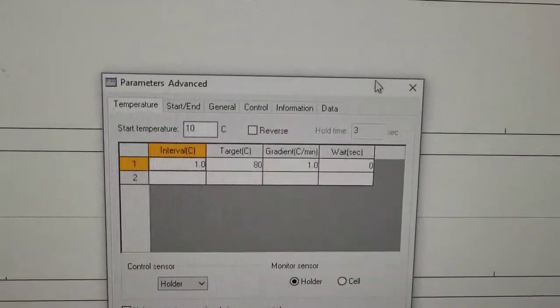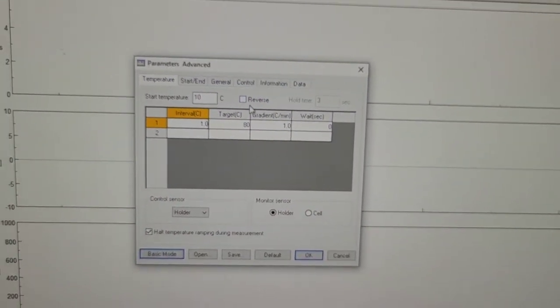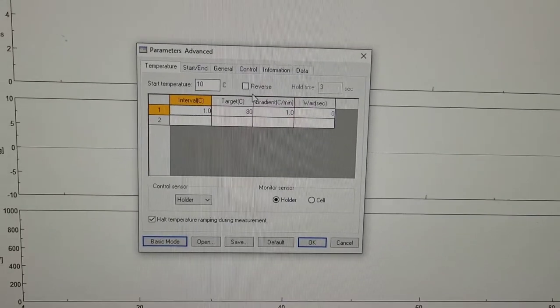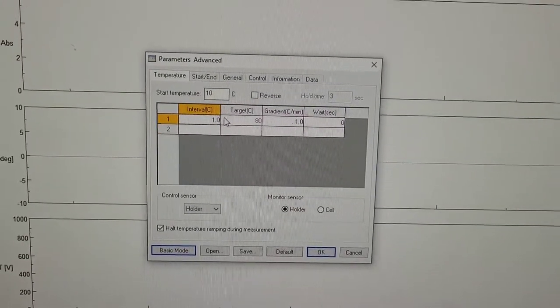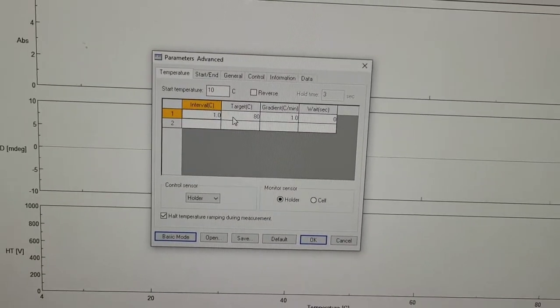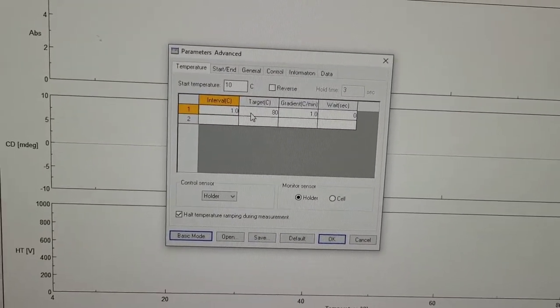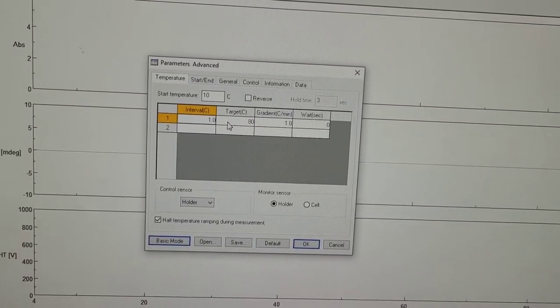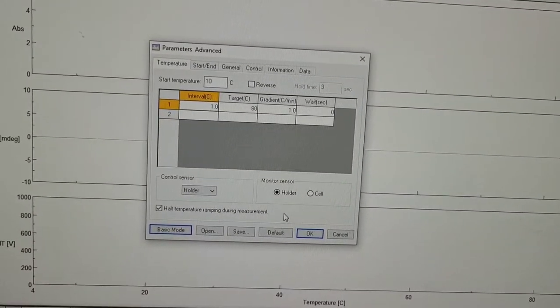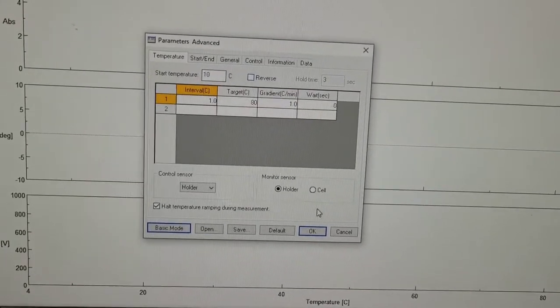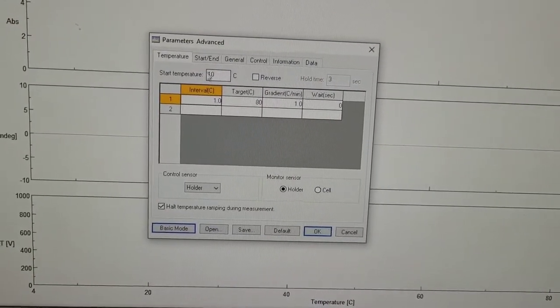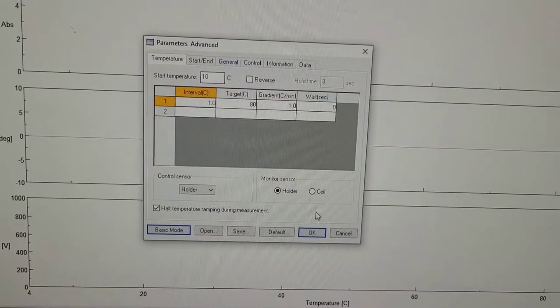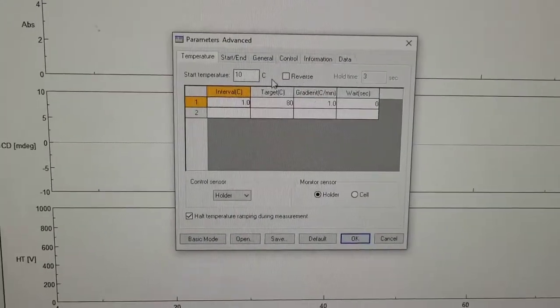So you can select reverse if you like. This will do everything in reverse. After you reach 80 degrees, it will bring the temperature down. And for some proteins, the denaturation can be reversible, but for my case, it definitely is not. So I will not bother doing this, but if it's your first time, I would say try it.